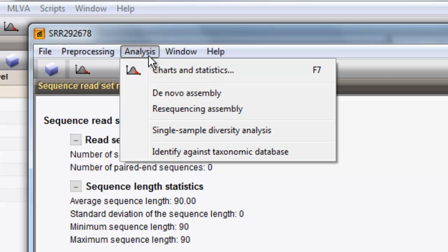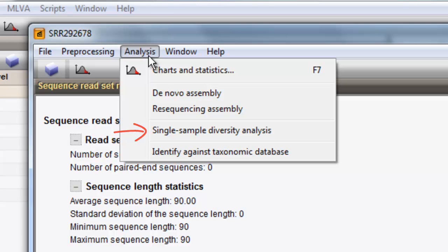The assembly analysis can either be remapping of the reads onto a reference genome or a de novo assembly. Metagenomics analysis can include a sample diversity analysis or an identification of the operational taxonomic units against a taxonomic reference database.